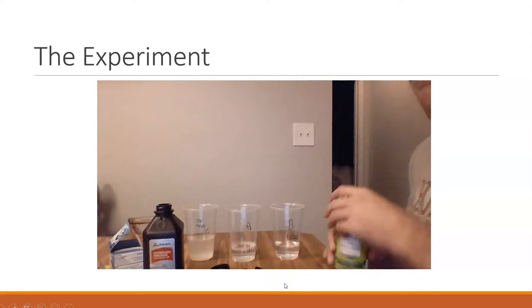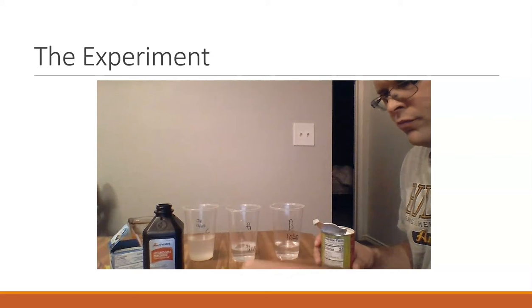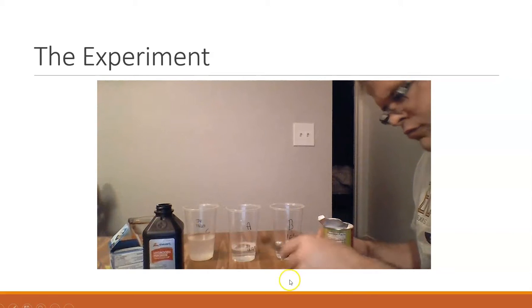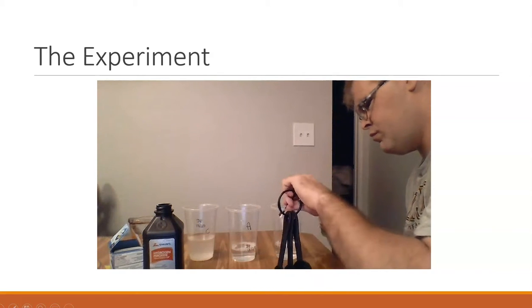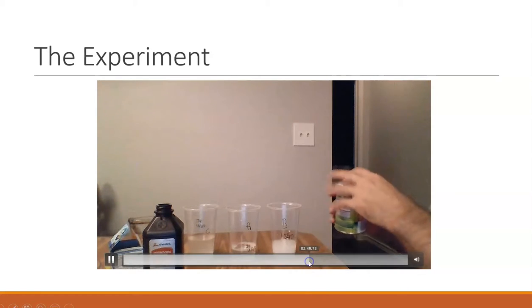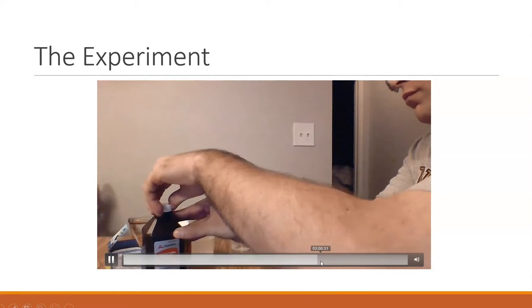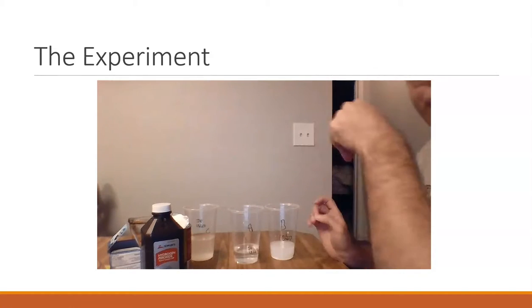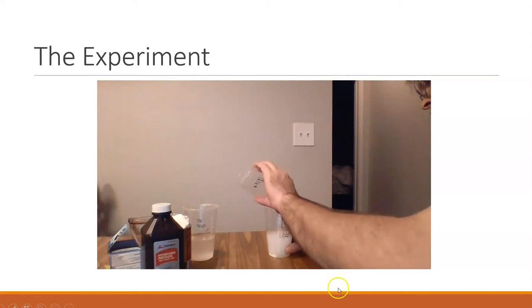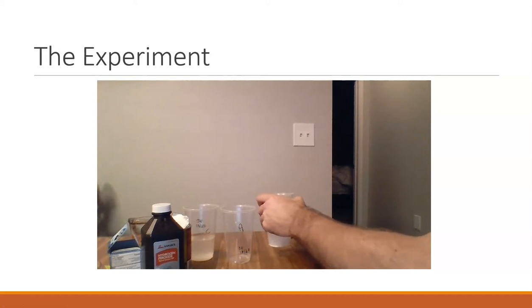Then we're going to get the cornstarch. Observing any changes.